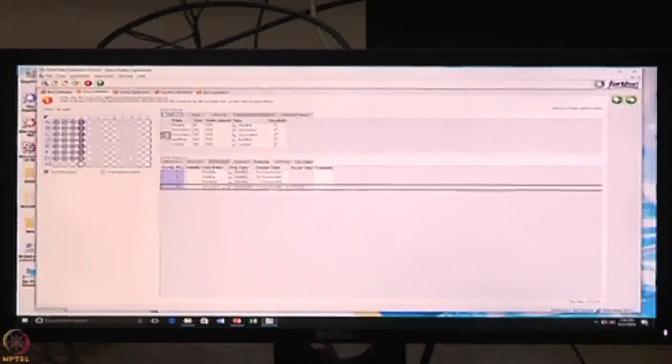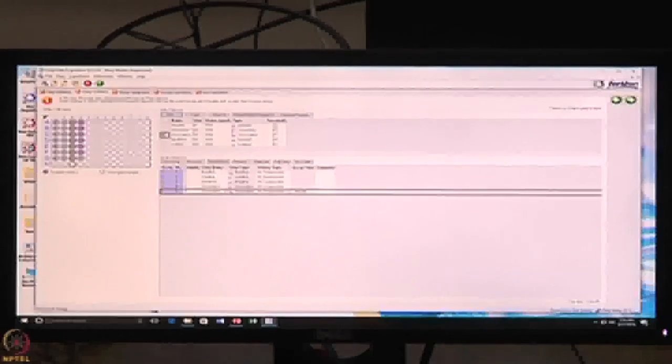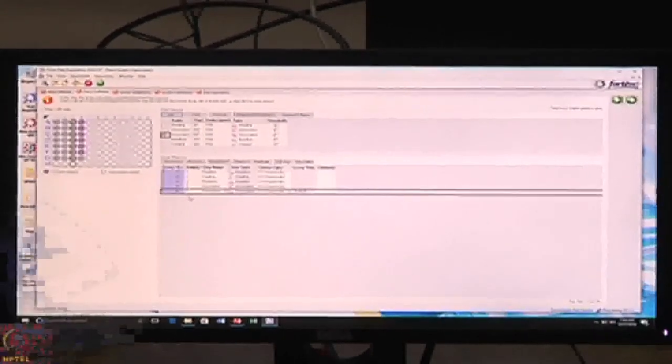I will do it in column number 3, the same buffer once again. So it is 1, 2, 3, 4, 3. The robotic arm moves to the first column and dips into the first well, goes to the second, then the third, the fourth, and back to the third.